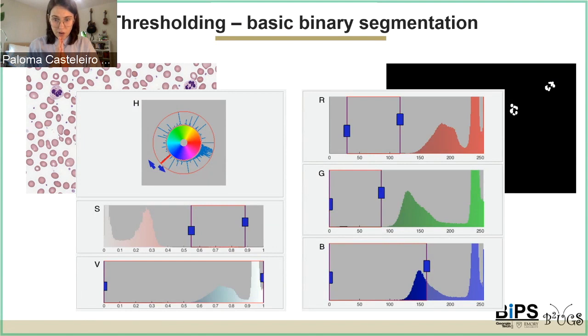So far we have covered segmentation relying on the brightness or the intensities of the images, right? You can do so with grayscale, or you can do so with color segmentation. But quite often, looking at just color or intensity differences is not enough.